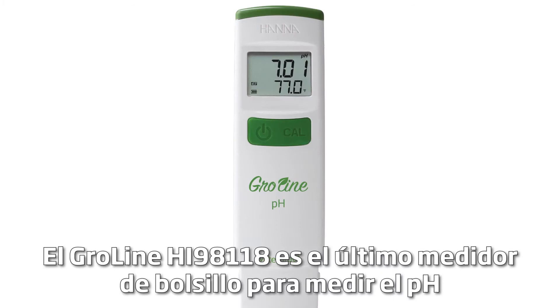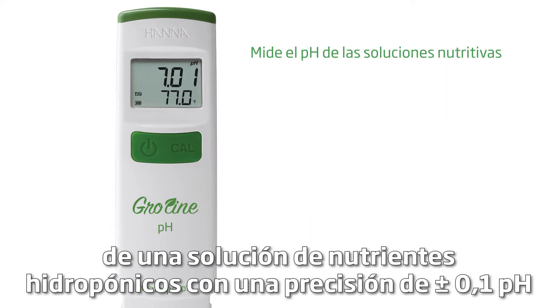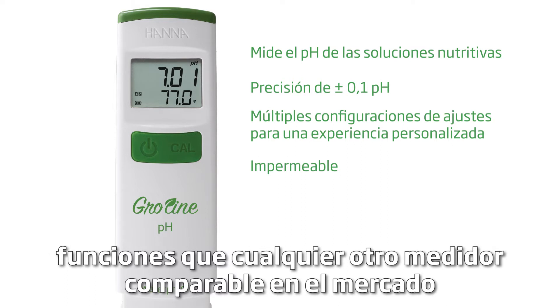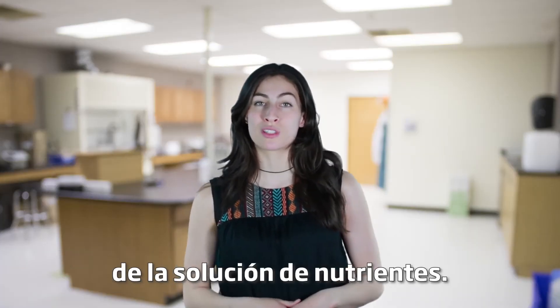The Growline 98118 is our latest pocket meter for measuring the pH of a hydroponic nutrient solution. With an accuracy of ±0.1 pH and an abundance of setting options, this advanced waterproof tester has more features than any other comparable meter on the market and is the right tool for growers who need to test the pH of their nutrient solution.